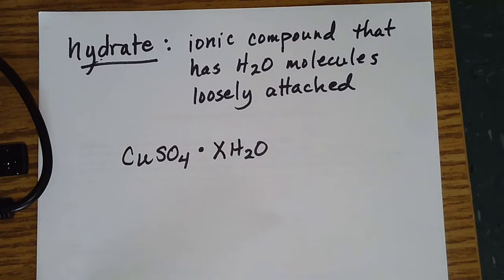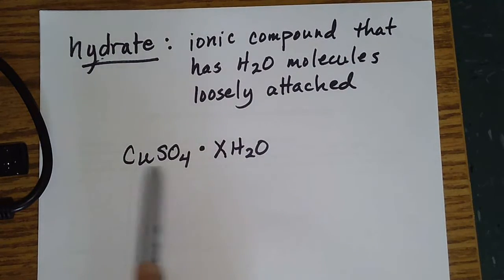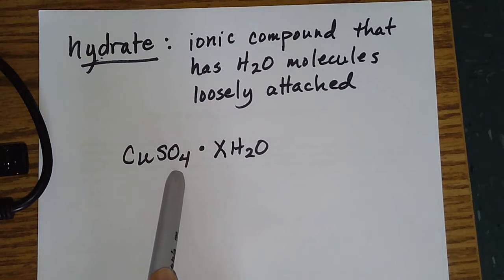We're going to use Bunsen burners tomorrow to heat it up. And by heating it up, we're going to cause the water to separate from the copper 2 sulfate. And it's going to do what? Where's the water going to go? It's going to evaporate into the air. And so once you're done, the water's going to be pretty much gone. It's going to be up in the air. You're going to have the leftover copper 2 sulfate that is no longer hydrated.